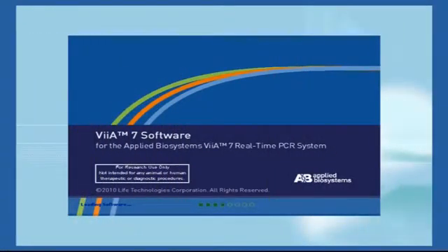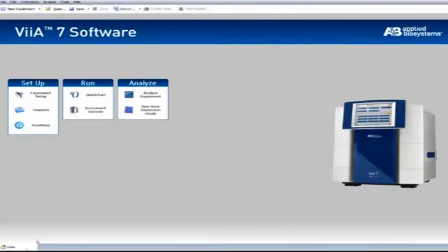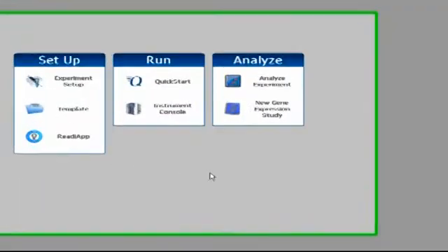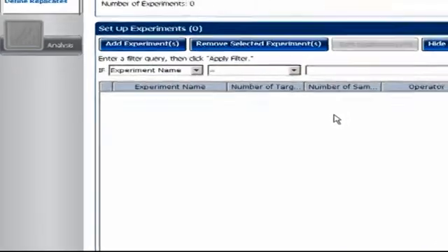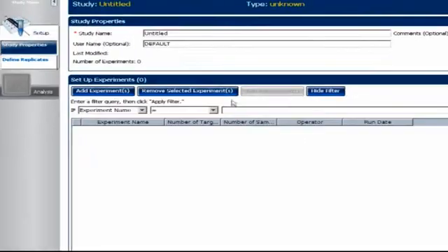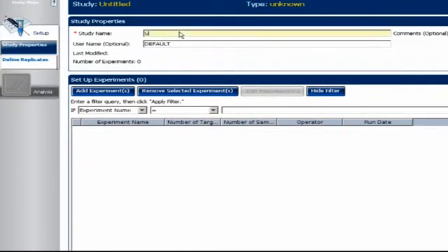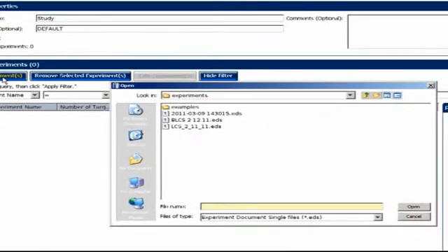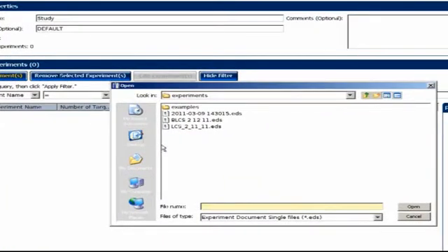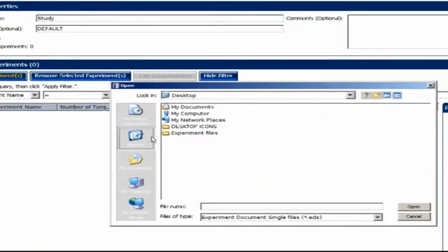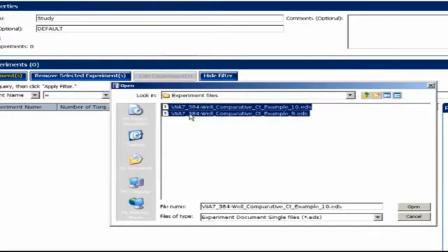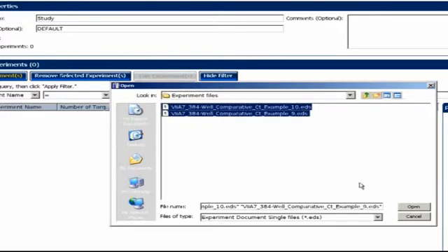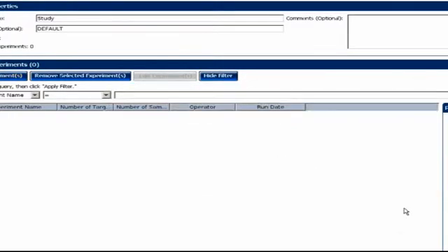Let's begin with the VS7. To start a new study, from the home screen, click New Gene Expression Study. Give this study a unique name. Click Add Experiments. Browse to your run files, all of which will have the extension .eds. Open them either as a group or one by one. Note that there's no absolute limit to how many files can be combined.